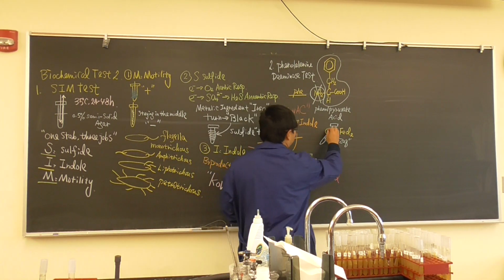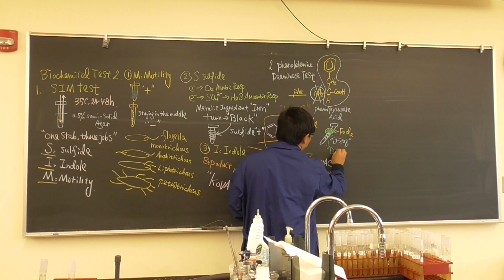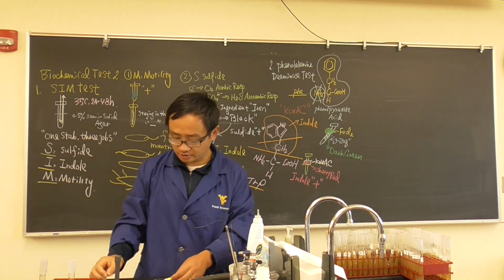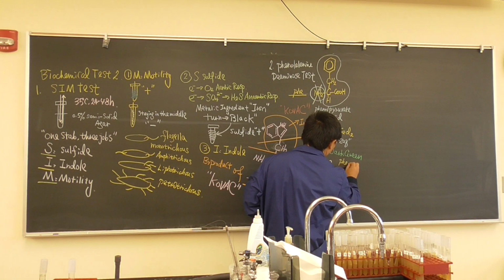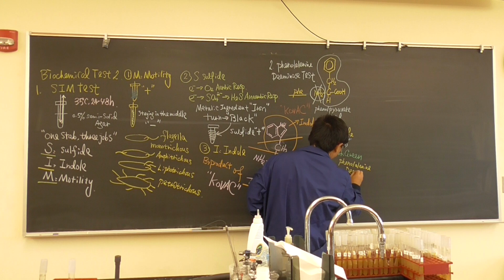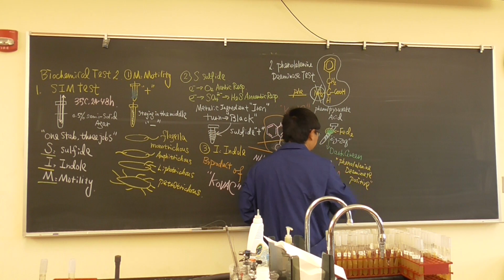If this area turns dark green, then it's a phenylalanine deaminase test positive. Okay?